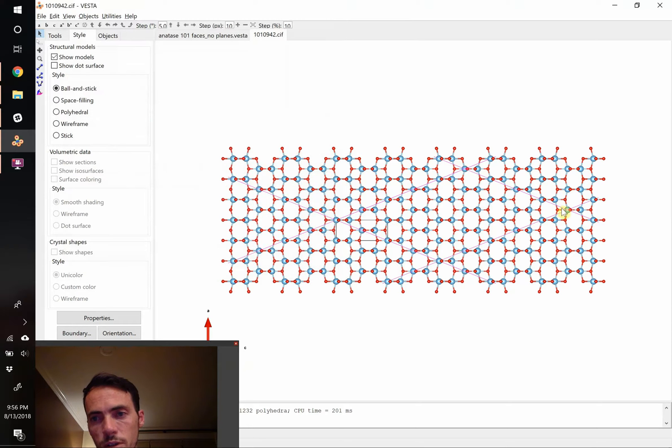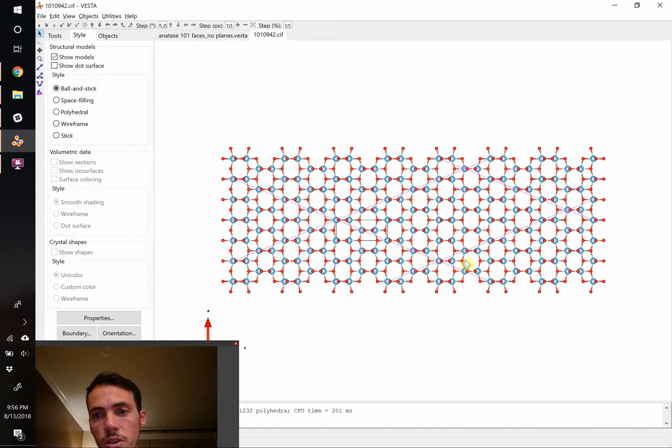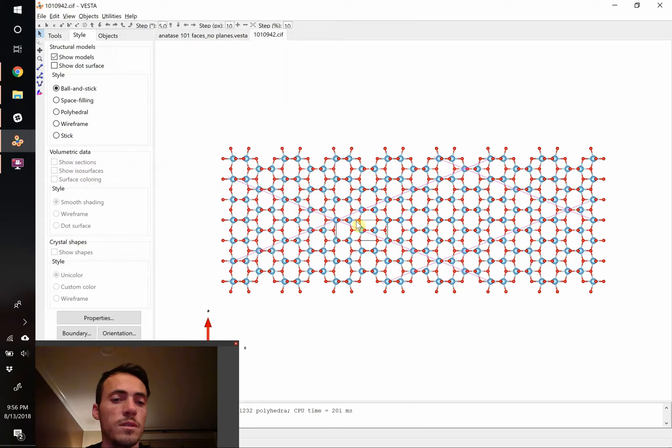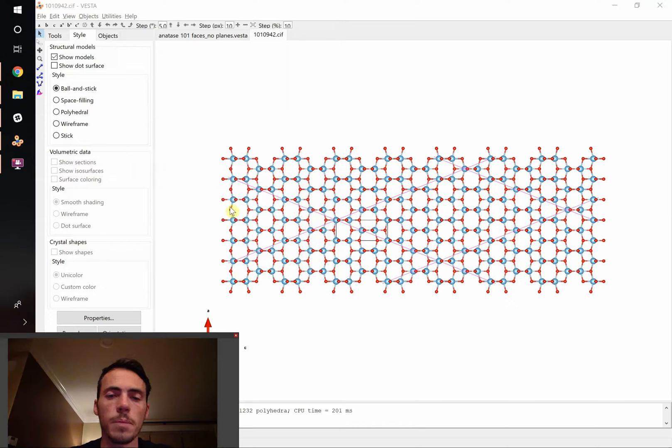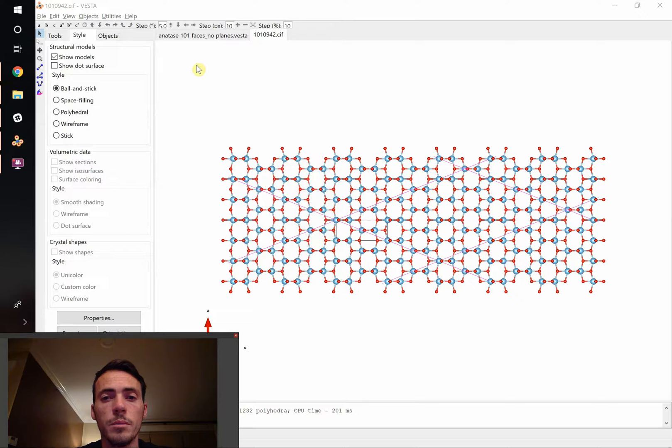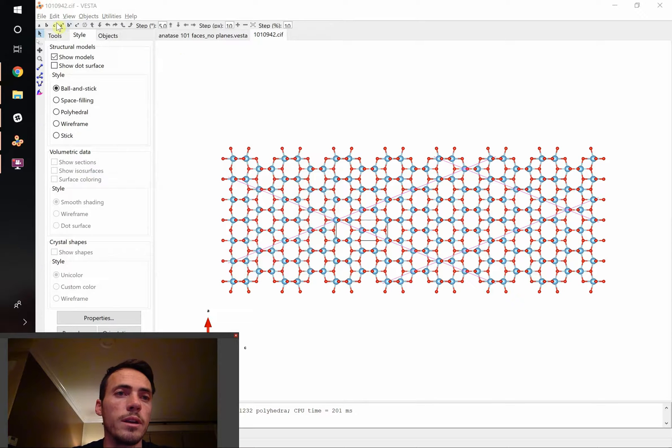You see this sort of diamond-like structure forming here. This is the crystal it's forming that has the faces of interest. Now what we'd like to do is we want to cut out all the atoms that aren't intersected by that plane. So how do we do that?